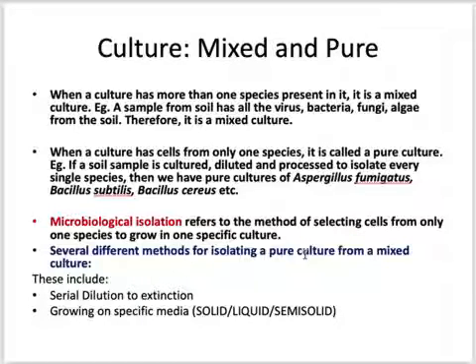That means only one species will grow there, in one specific culture.